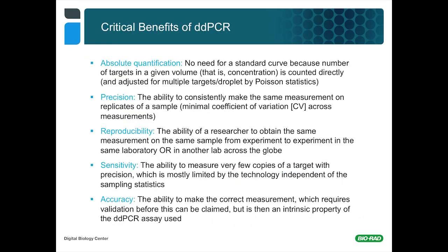Just to start off, to give you some sense of the benefits you can anticipate from deploying droplet digital PCR: as I said earlier, you get absolute quantitation, so you have no need for a standard curve, and some of the difficulties that engenders in actually having reliable standards that behave the same way as your experimental sample, which may have matrix components that can alter the rate at which your fluorescence rises in a real-time reaction and lead to uncertainty there.